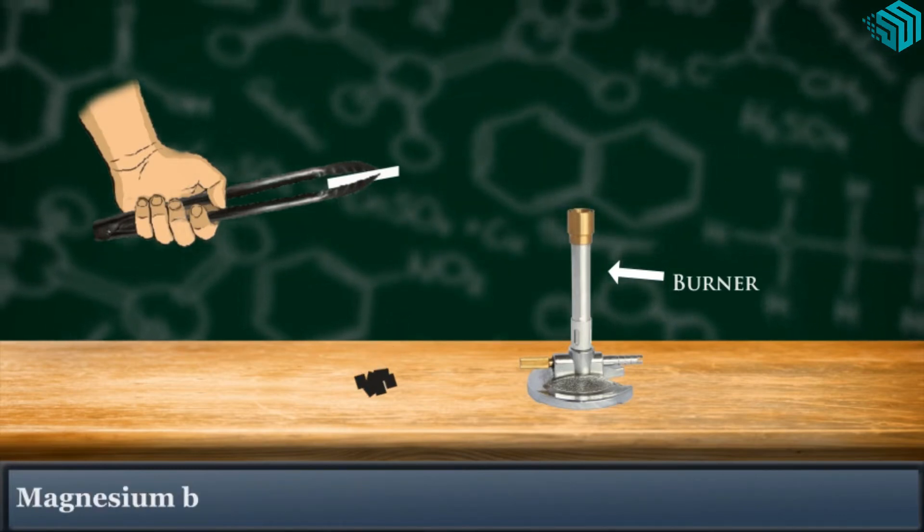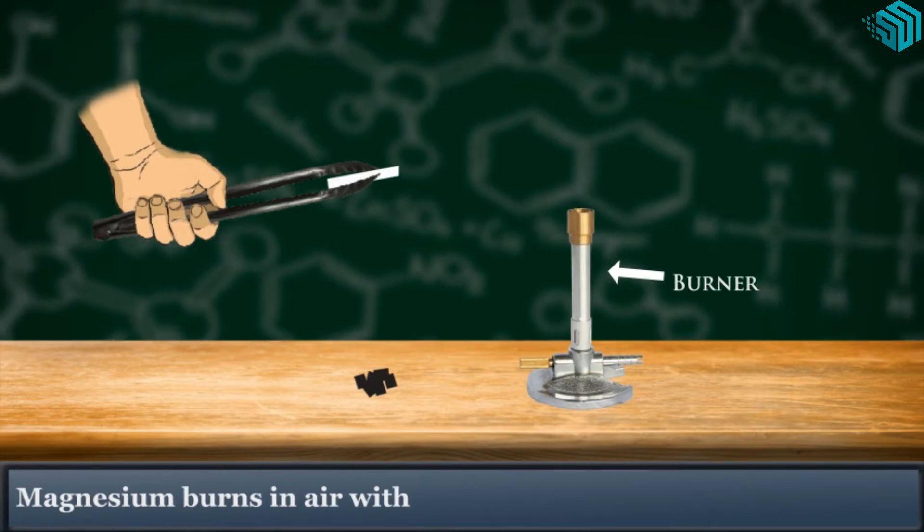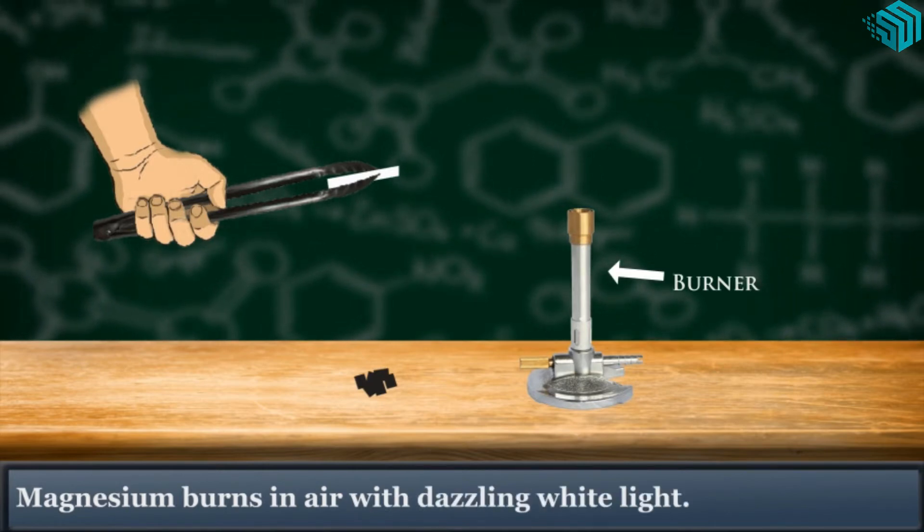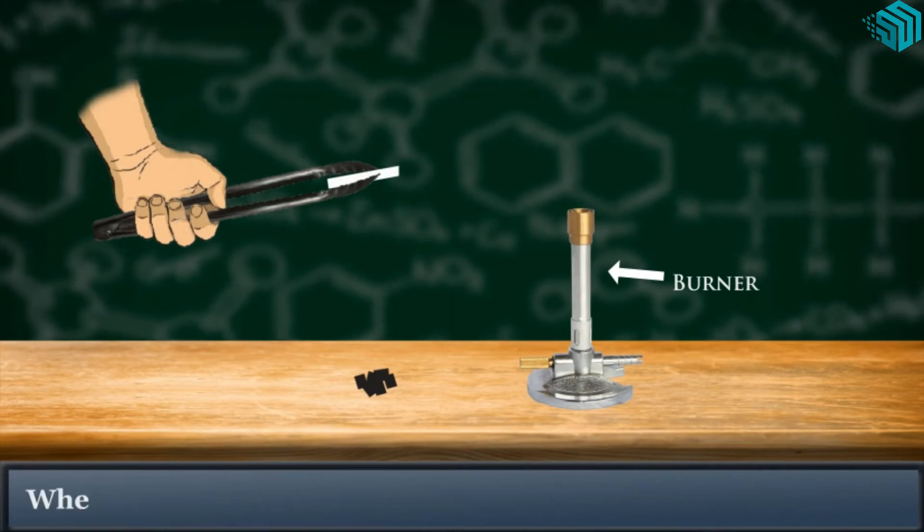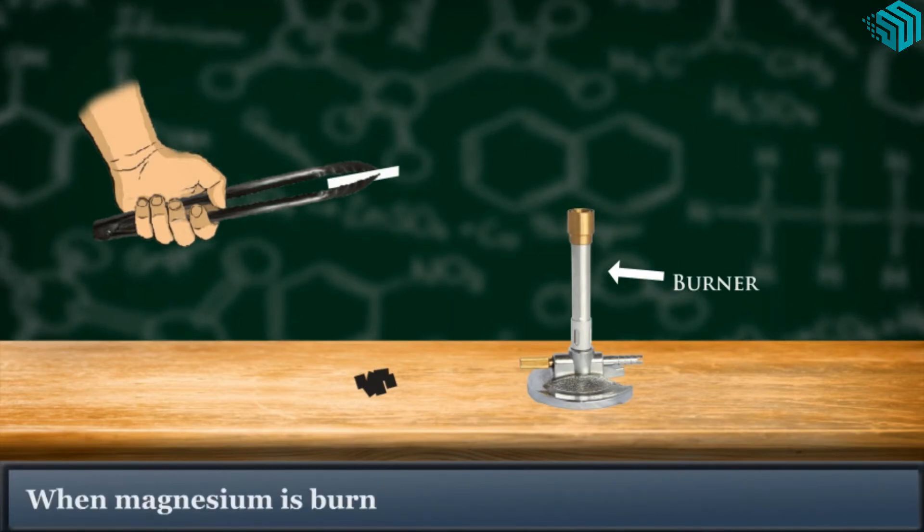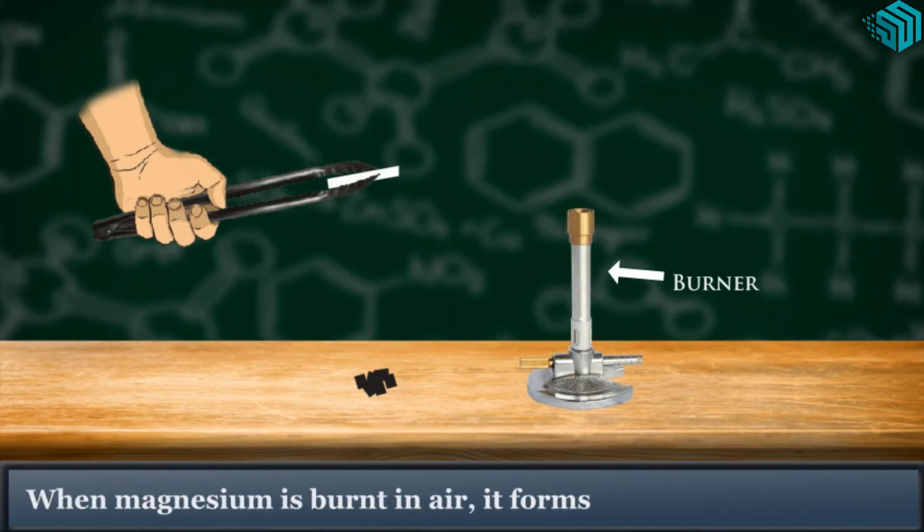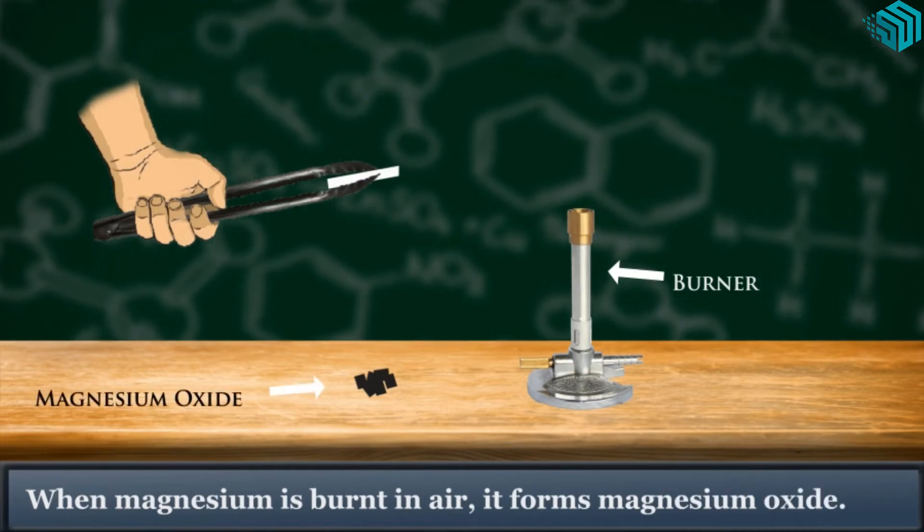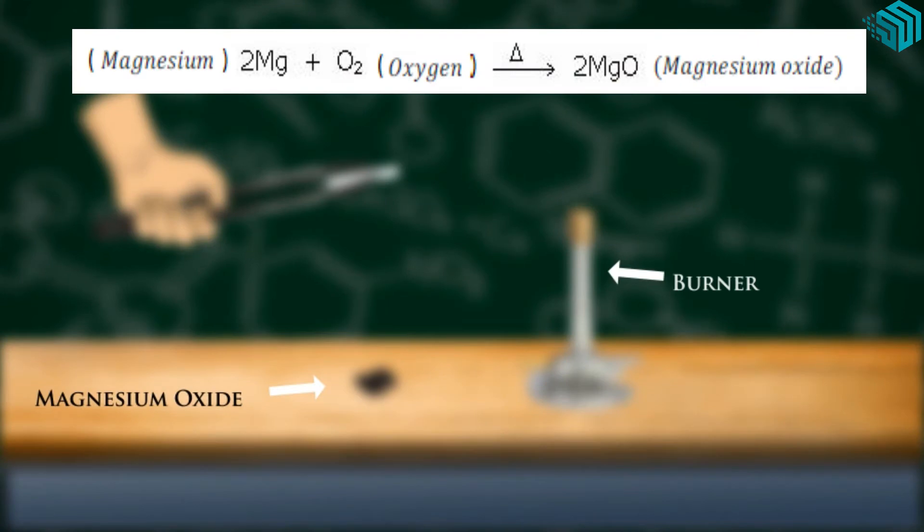Magnesium burns in air with dazzling white light. When magnesium is burnt in air, it forms magnesium oxide. Magnesium plus oxygen gives magnesium oxide.